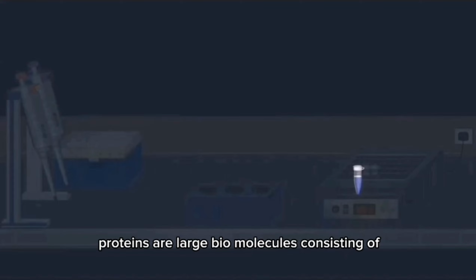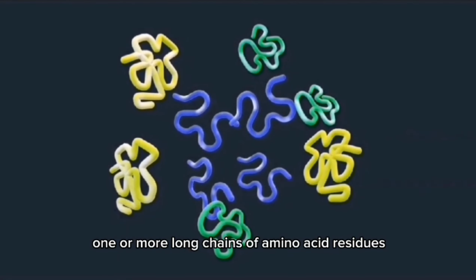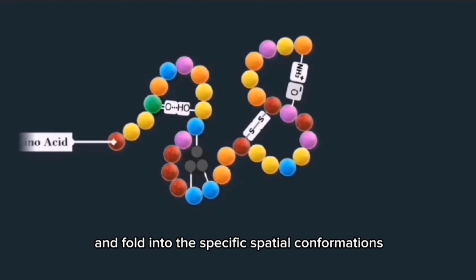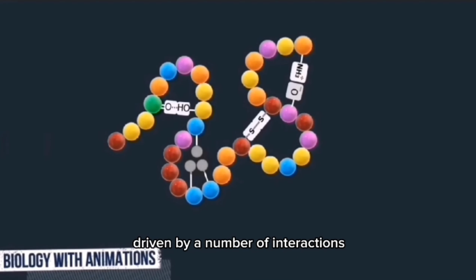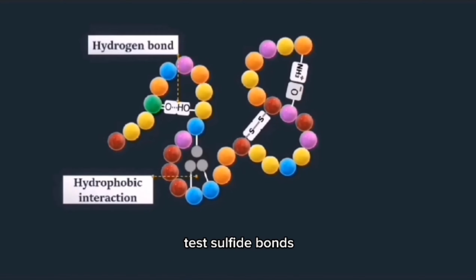Proteins are large biomolecules consisting of one or more long chains of amino acid residues. They are formed by linking amino acids with peptide bonds and fold into specific spatial conformations driven by a number of interactions such as hydrogen bonds, hydrophobic interactions, disulfide bonds, and ionic bonds.